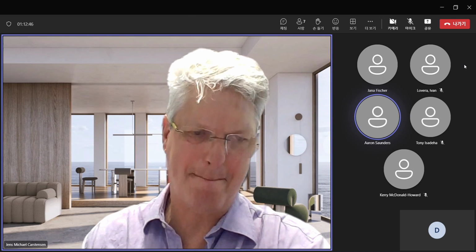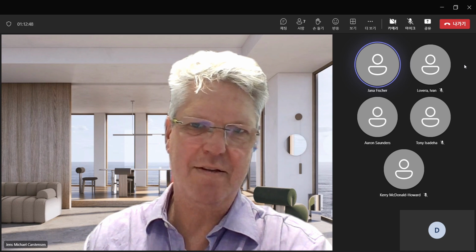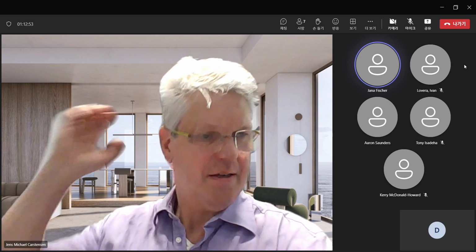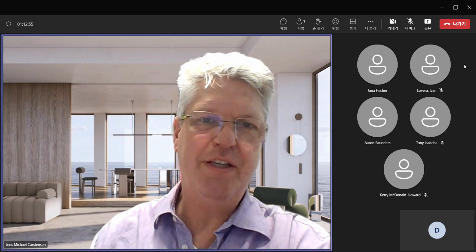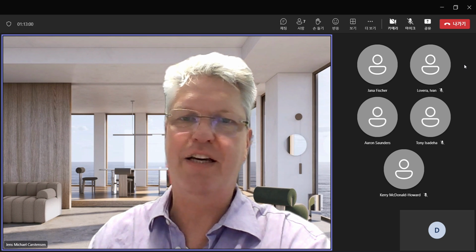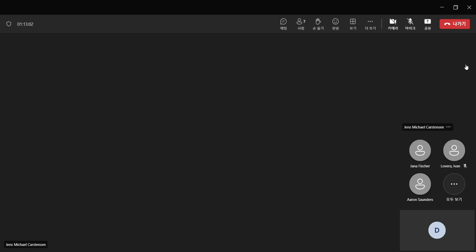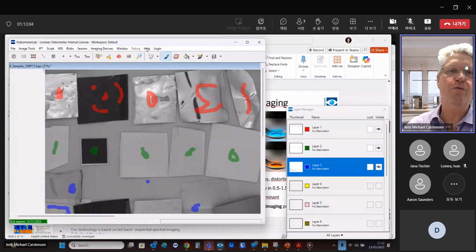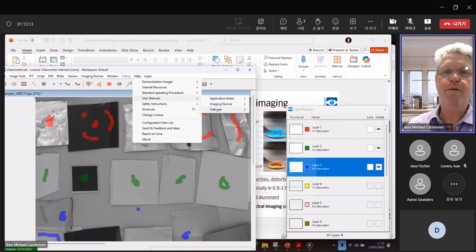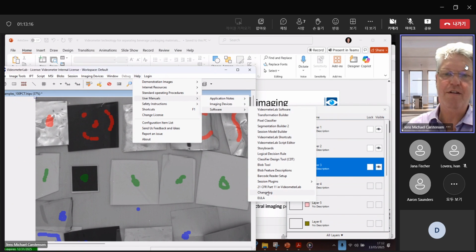Right. Are these updates coming with a sort of brief introduction as to what is being updated and what is different? It always comes with a changelog. So if you go ahead, I can again just share the screen, here we go to Help, User manual, Software, Changelog here. It's also on the website now where you download.